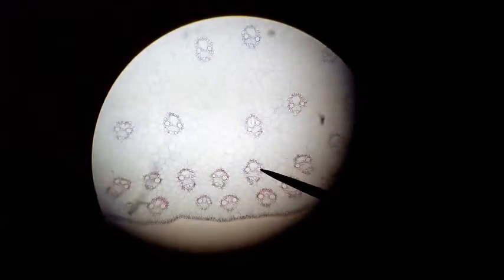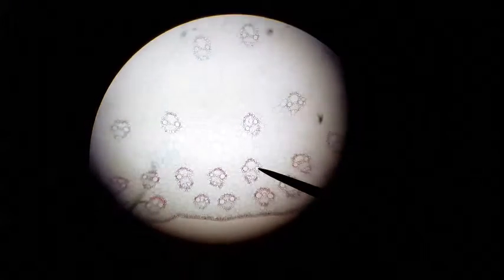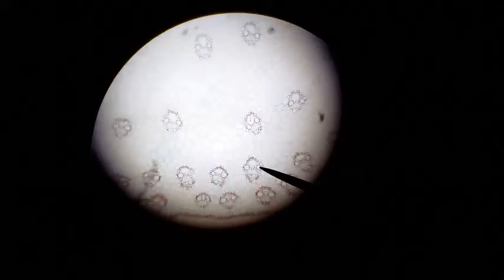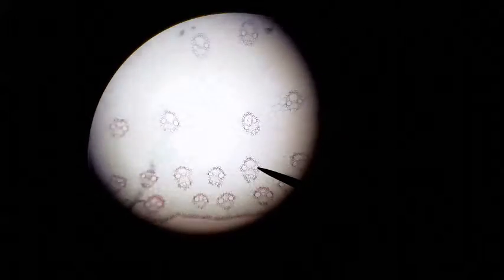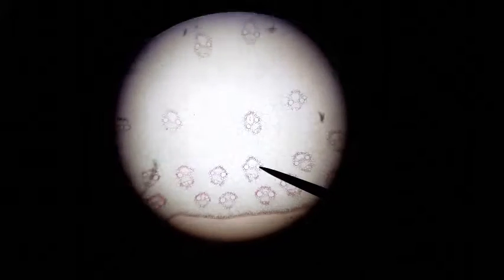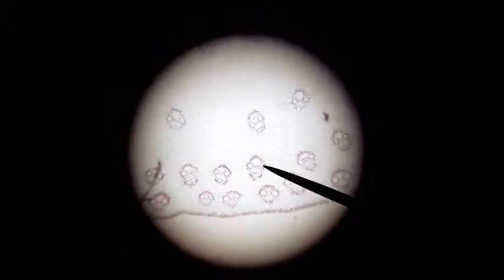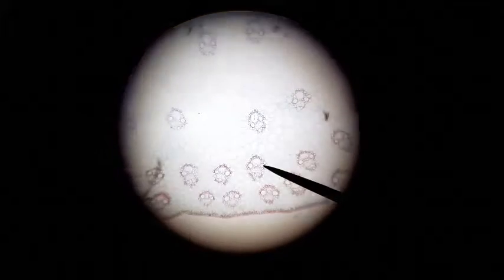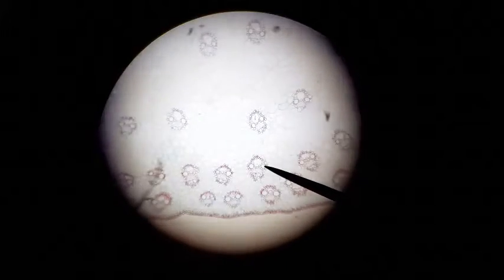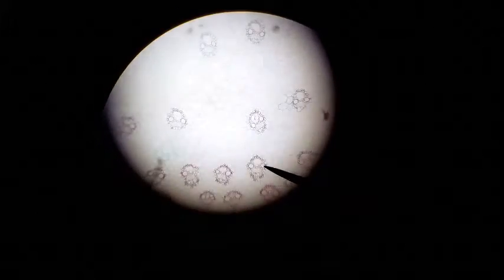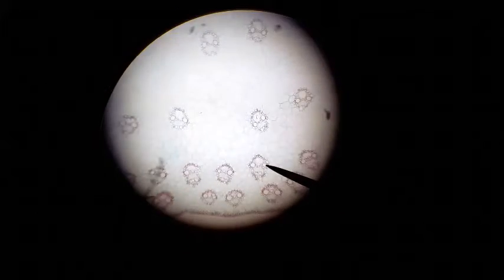This is the 100x magnification of zea corn stem. The big circle and the two eyes at the top consist of xylem. These are the vessels and tracheary elements are nearby. Down below there, before we get to the bottom of each island, is the phloem, which consists of sieve tubes and companion cells.